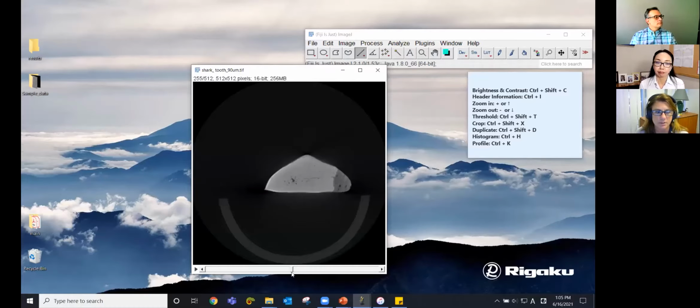All right, so I'm launching the polling, and you should see the question. How big of a file can we analyze using ImageJ? We'd like you to answer this question. Do you think it's 128 megabytes? Is it as big as the RAM size, or is it something that you set in ImageJ? We'll give a few seconds so that we have enough people voting, and a few more seconds, and I'll end the polling and then share the results with you.